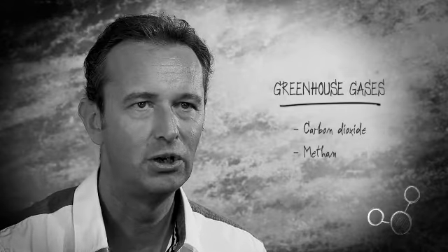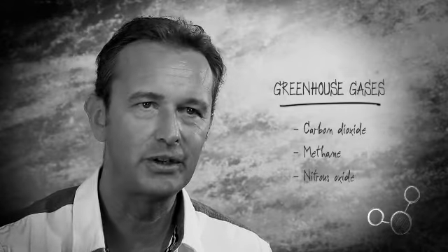Greenhouse gases are trapped in these tiny air bubbles. We'll measure CO2, methane, and nitrous oxide, the three main greenhouse gases caused by human activity and which can be studied over time thanks to the air bubbles.